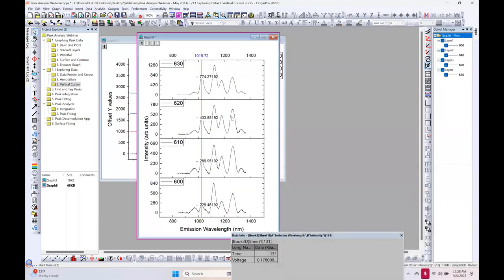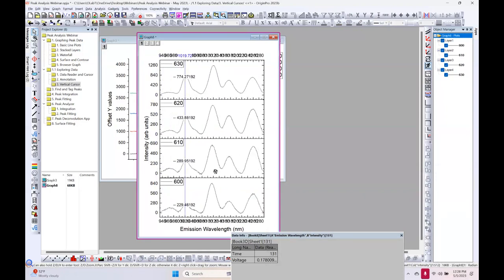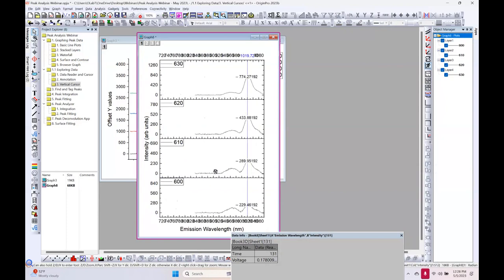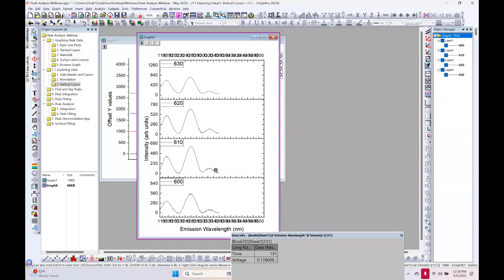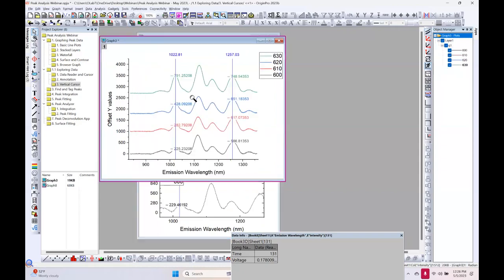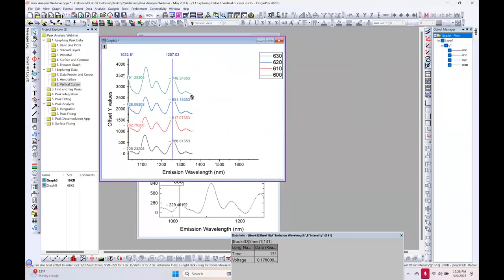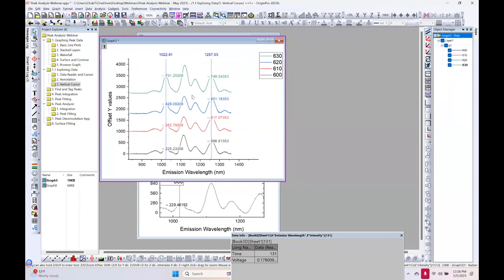One thing to mention: when layers are stacked, by default they are all linked together. If I hold the Z key and use the mouse wheel, they all zoom together. If I hold the X key and use the mouse wheel, I can pan. The same zoom and pan works with the Y offset plot as well — hold Z to zoom, hold X to pan.